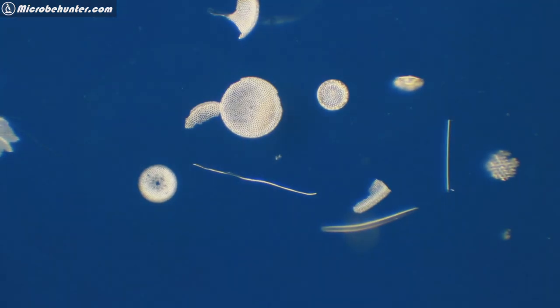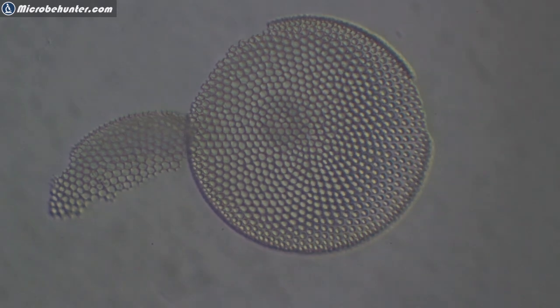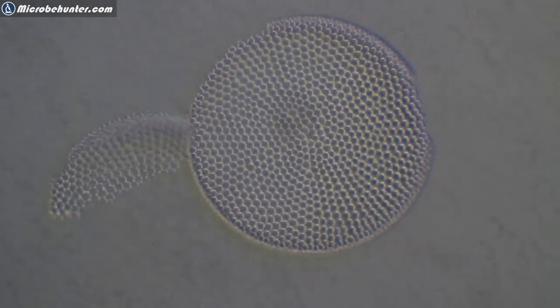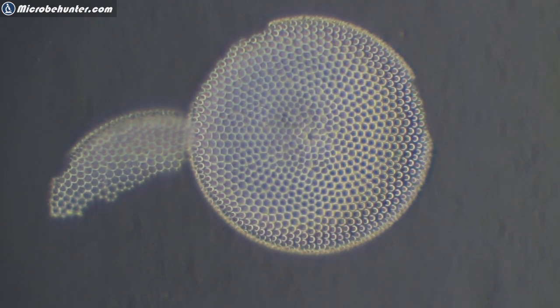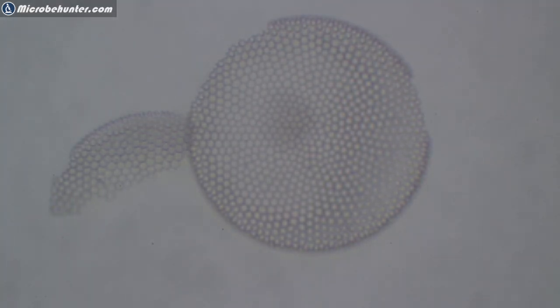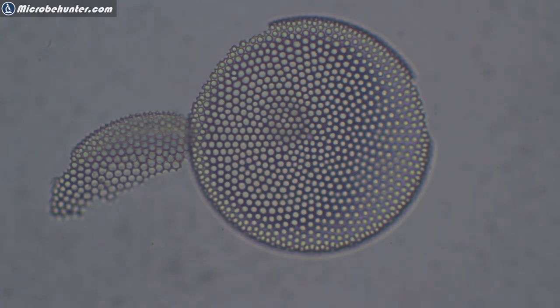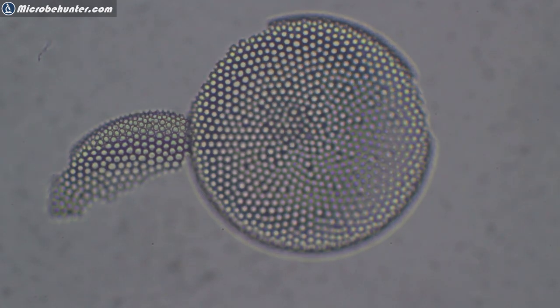Yeah, so these are, again, the diatoms, they work quite well. And here again at a slightly higher magnification, I'm now simply moving the filter in and out, and you see how the image can actually change this way. I think it's a nice and a very convenient way of increasing the different images that you can get using a microscope. And it's actually really easy to make. Now we're back in bright field. And the camera, of course, also adjusts a little bit the exposure time. So it looks actually a little bit better in real, when you look really at the image itself.